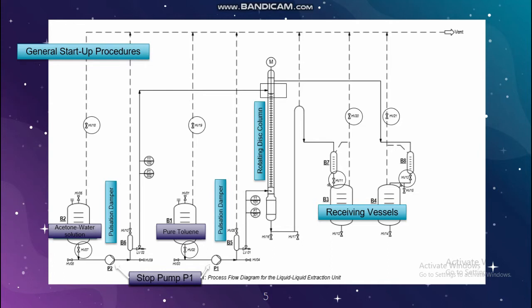And the last one is to switch on the PC to open the Soldas software. The speed controllers are now ready to be controlled using the stirrer controller or from Soldas.